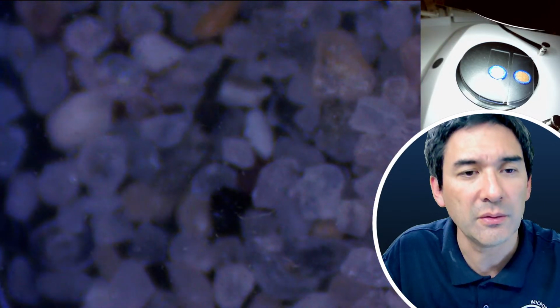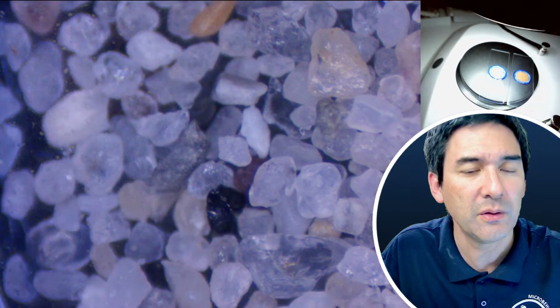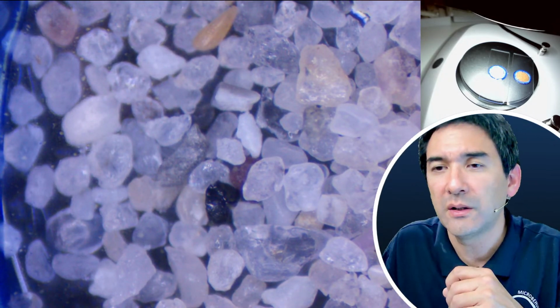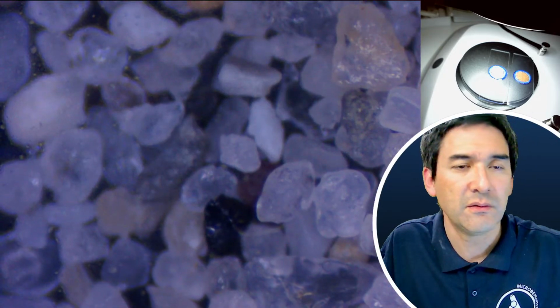What is this here? I don't know. So go up a little bit with the light. No, that's the other one here. Yeah, you get the idea. Okay, so that's basically the second example.